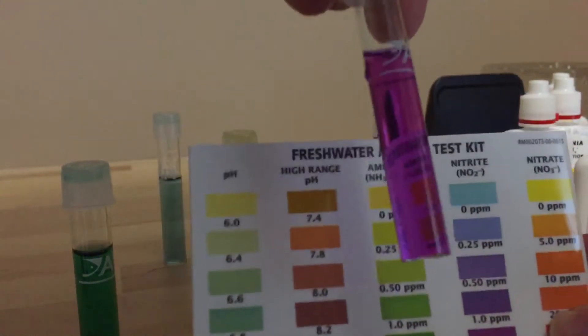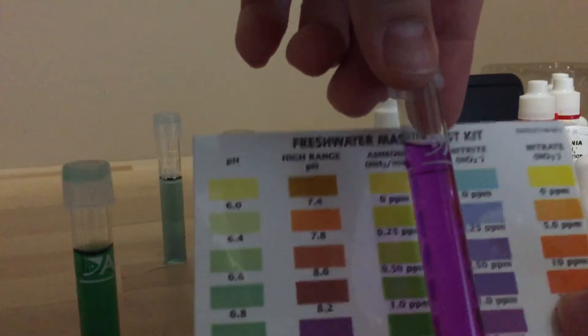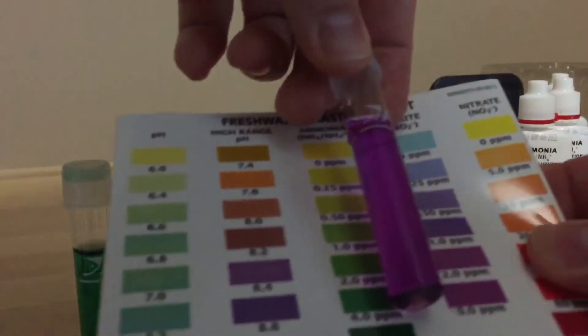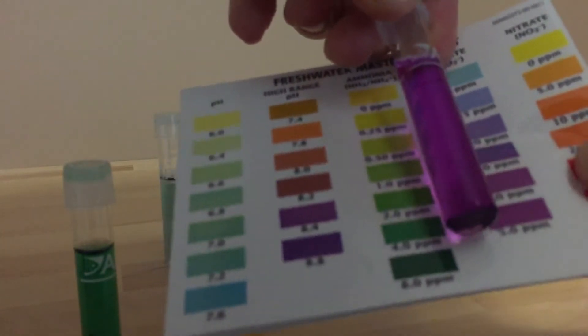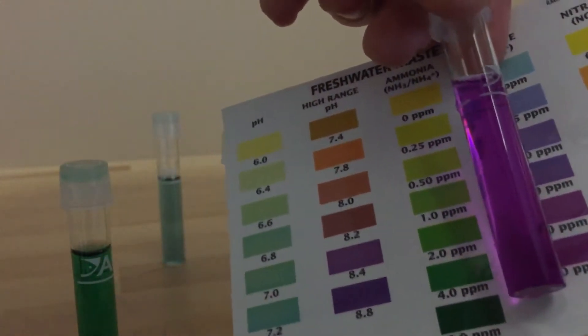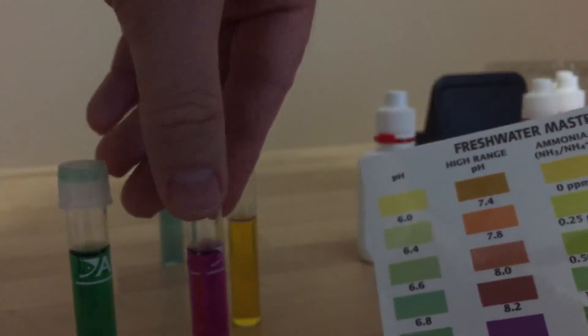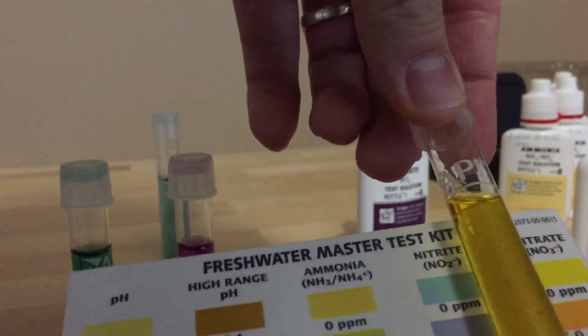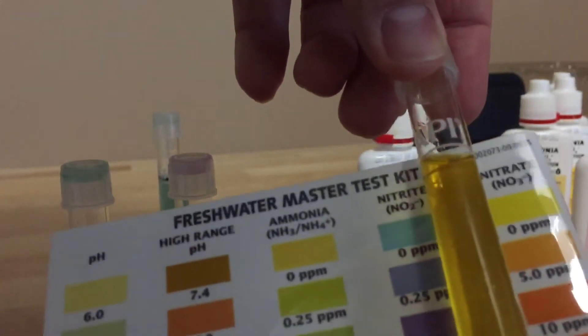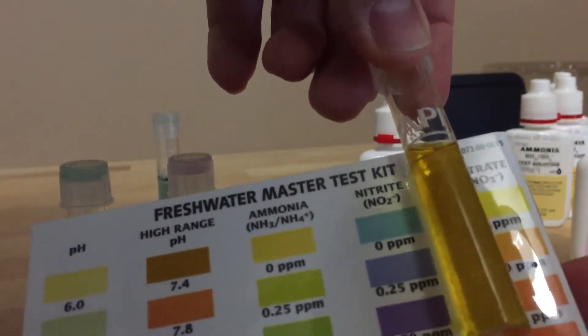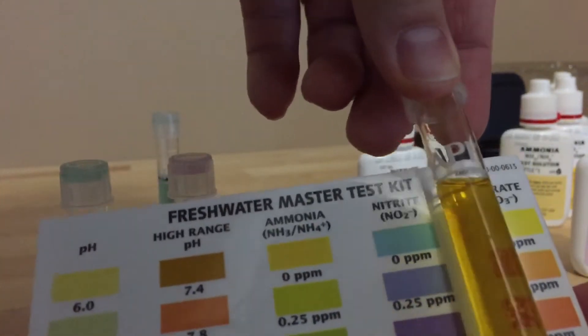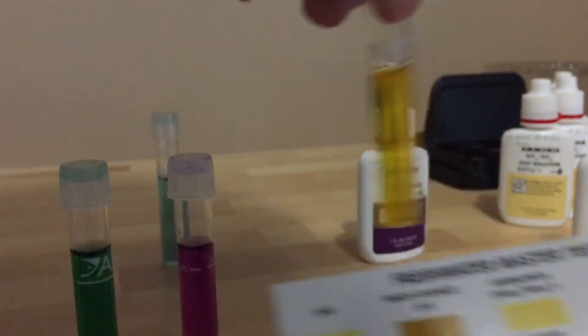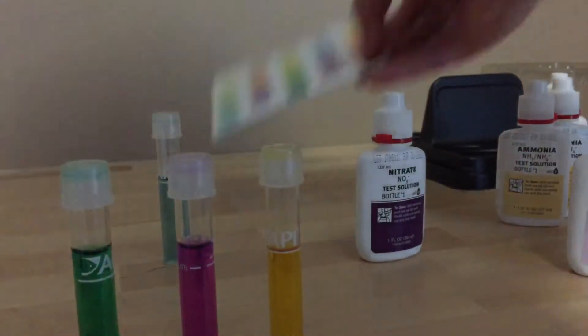Now this is what I want to see: I want to see nitrites so I know that my cycling process is happening. And looking at that again on the scale, you see that's probably around two, two ppm, which is good. And then what we really want to see here is that's just off yellow which means the nitrates are just starting to form.